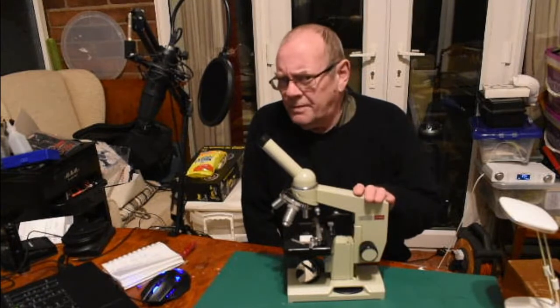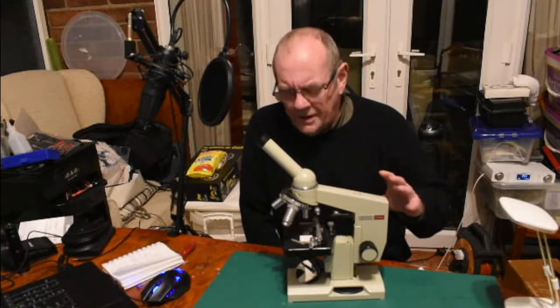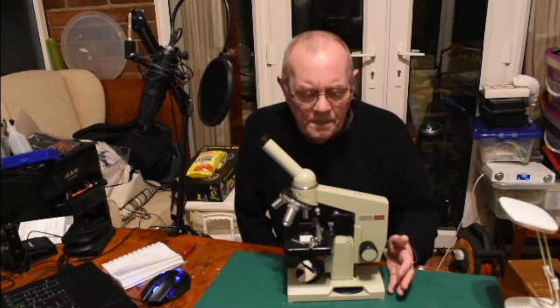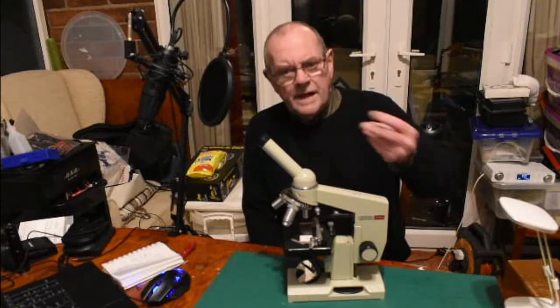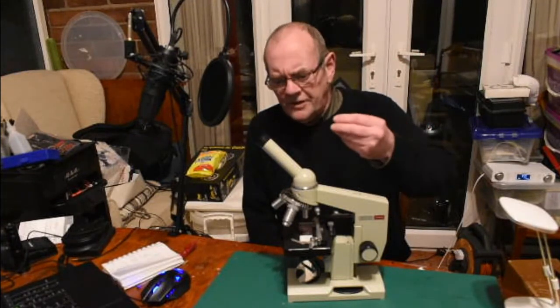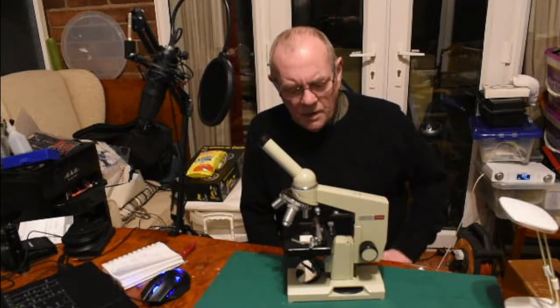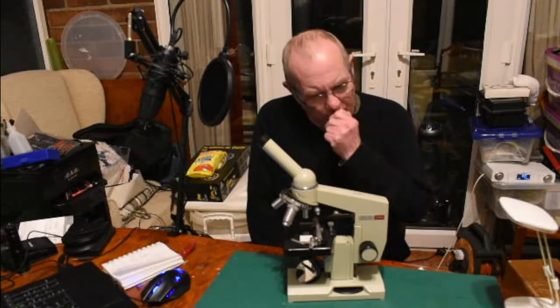This one is pretty bulletproof, though it does have its limitations. If money is no object, go and buy one of the big four: Nikon, Olympus, Zeiss, or Leica — fantastic, you won't go wrong with those. But we can't all afford around a thousand pounds — I certainly can't.